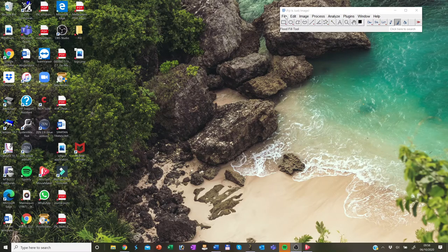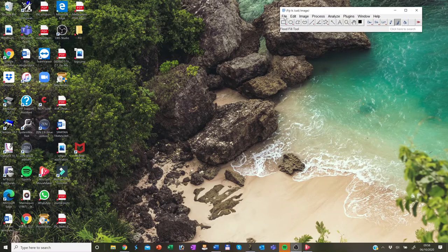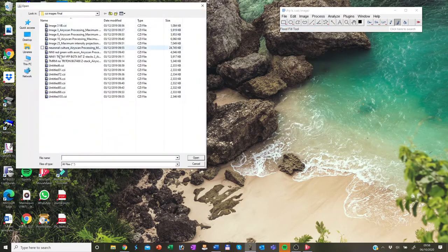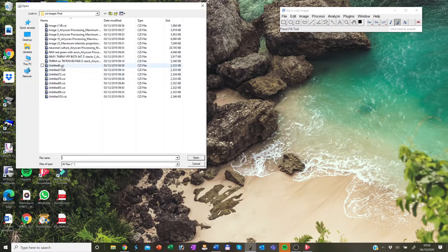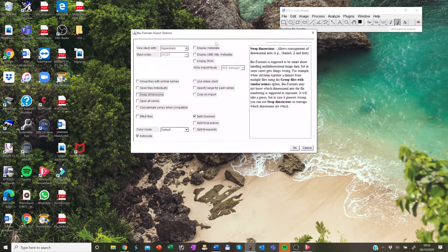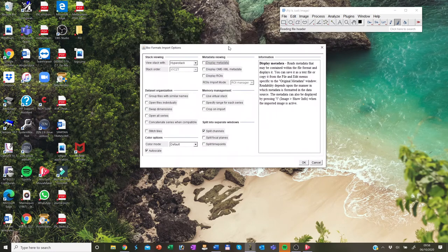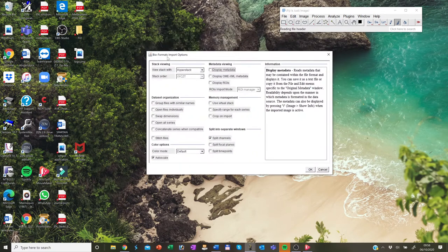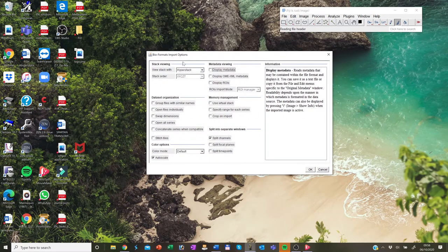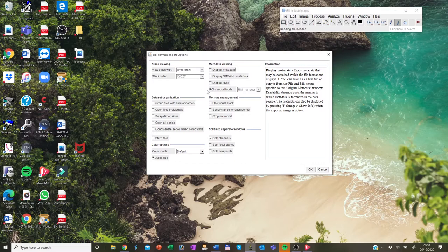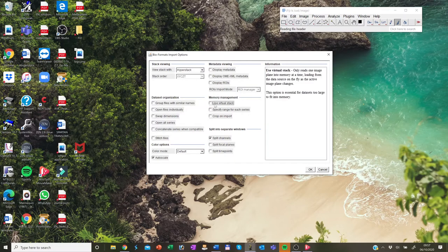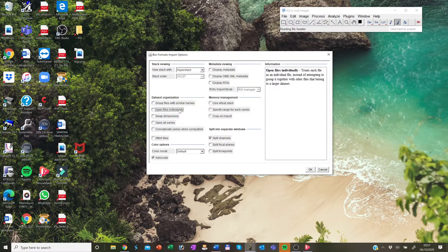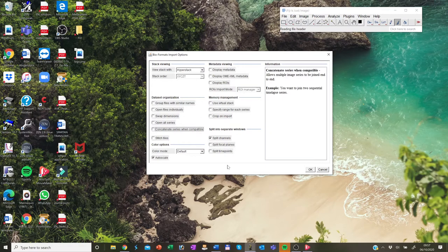So if bio format is used, you will be prompted with a big dialogue and your preferences are usually remembered. So for example, if I go on file open and open up an image, immediately I get the bio format import options.